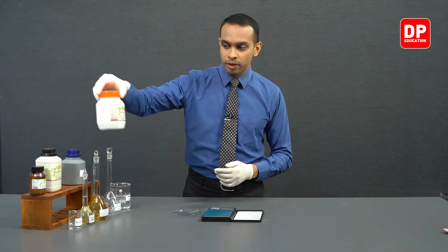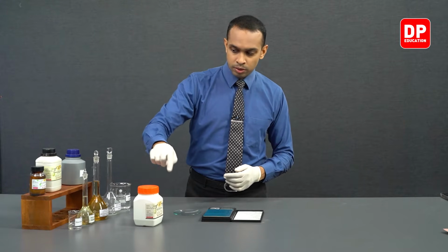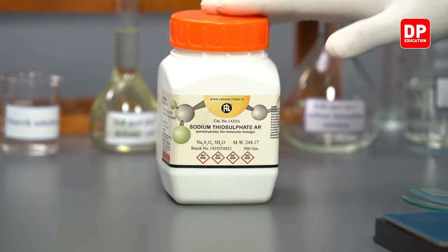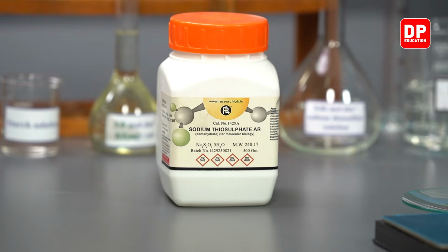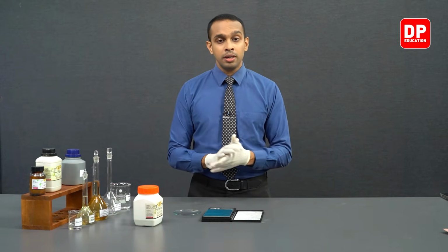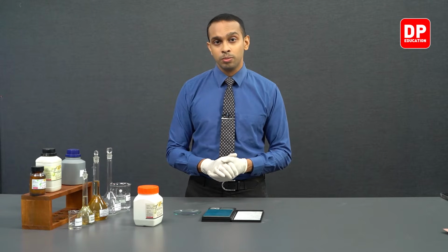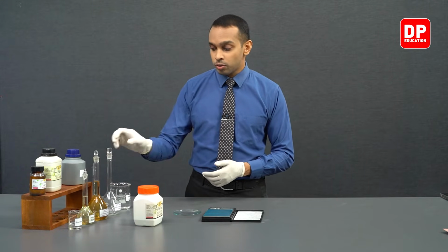The solid that we have over here is sodium thiosulfate, or Na2S2O3·5H2O. So the molar mass of this is going to be 248.17 grams per mole, and we need to prepare a solution that has a concentration of 0.06 moles per decimeter cubed, and we are going to prepare it in this volumetric flask.